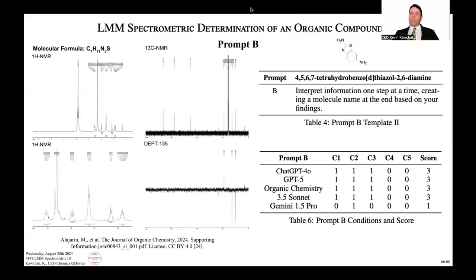But the feeling that I got with these, especially with this one and the next one too, is that in this one, it came out way after its training. So even though the structure is labeled, it'd be really hard for it to give a correct answer, which it didn't in this case. Now, for the previous example, the first one did come out a lot before, like around 2000. But I also gave it two other questions that were easier, and it didn't get the correct solution. It was able to get it for that specific one.